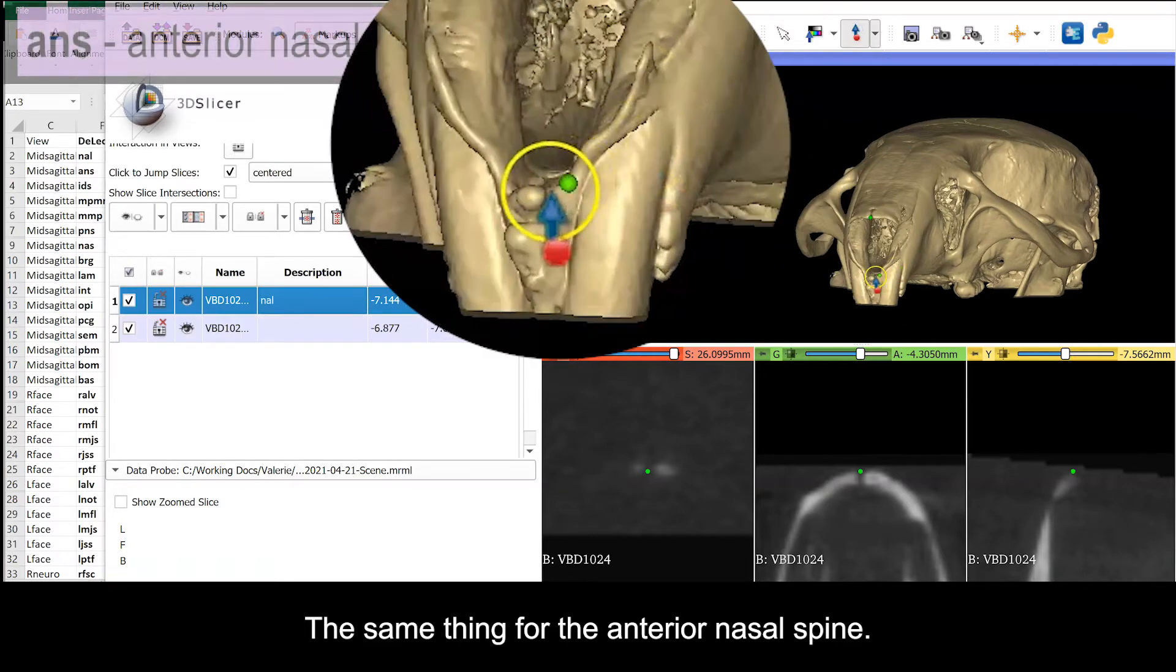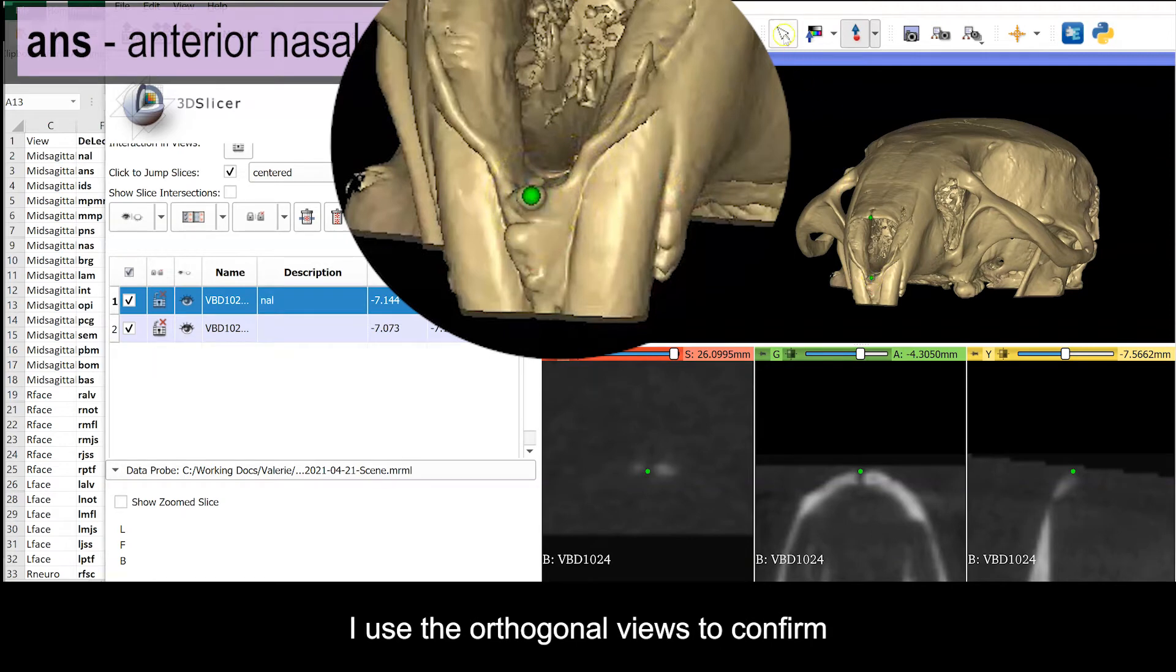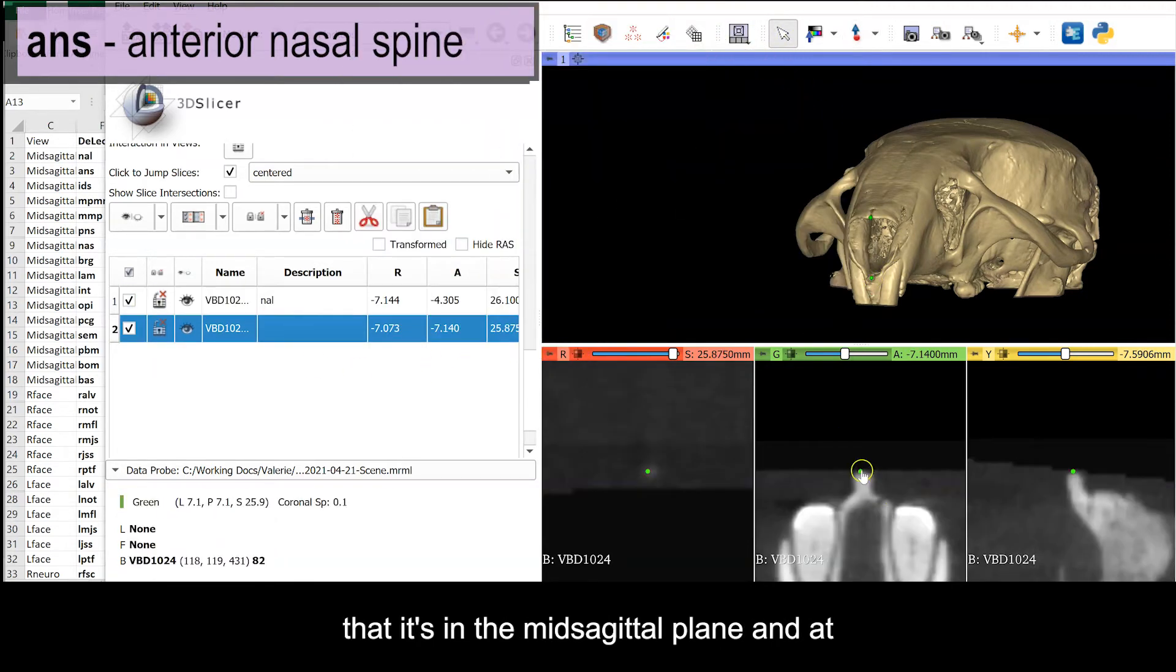The same thing for the anterior nasal spine. I use the orthogonal views to confirm that it's in the mid-sagittal plane, and at the most rostral point on this process.